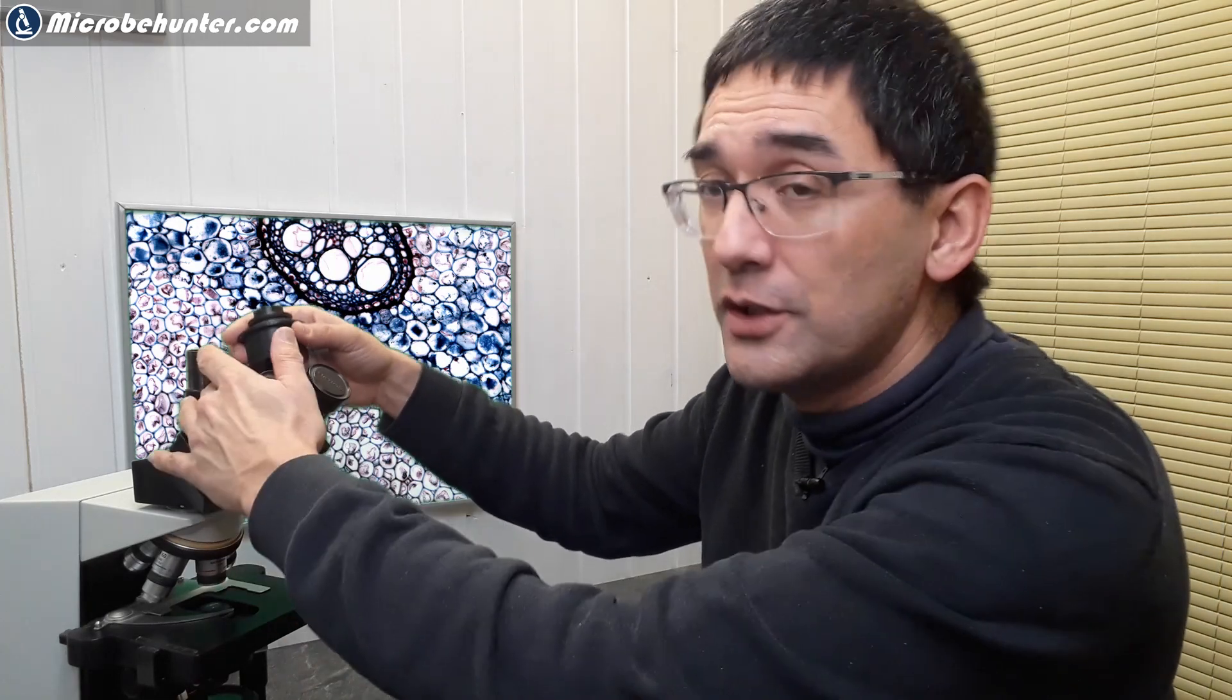What do we have over here as well? Something that you've also seen before. This is the original tube that comes in here. This one has a slightly different system. Well, not that different. It also has intermediate optics. Here we also have it's called a projection eyepiece and has a magnification of 2.5 times. Again, with the same purpose. It picks up the image there where it is formed and it makes sure that the image is resized in such a way that it fits nicely on the camera sensor. This one over here that 2.5 times actually is made for full format.